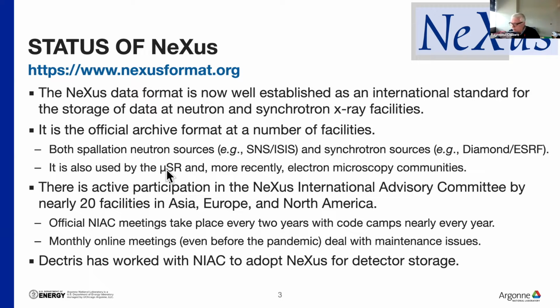also electron microscopy communities have just recently expressed interest. And in principle, it could be extended to other experimental techniques as well. And as I say, the NIAC, as it's called, is very active. We had a meeting only a couple of months ago.